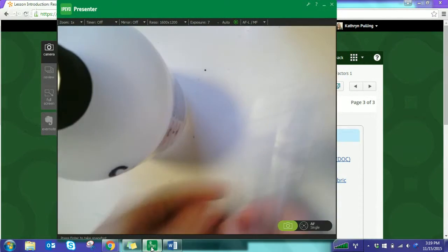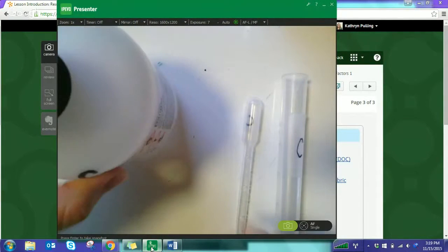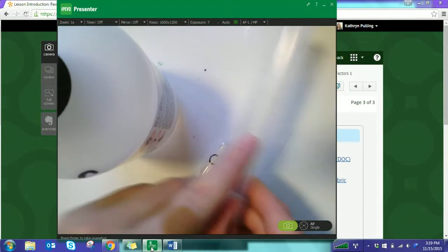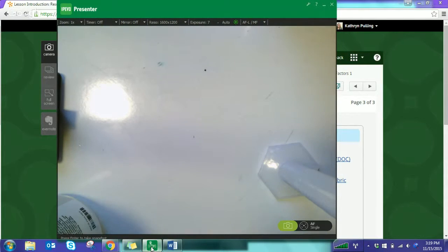Okay. And then just a reminder, before you can start this, you do have to add that 400 milliliters of water to C so that this becomes aqueous. You're not pouring the solid straight into your reactions. And then C, I need 20 milliliters. So I'm going up to almost the top of my graduated cylinder, or at least top of the measurements. It only measures 25.